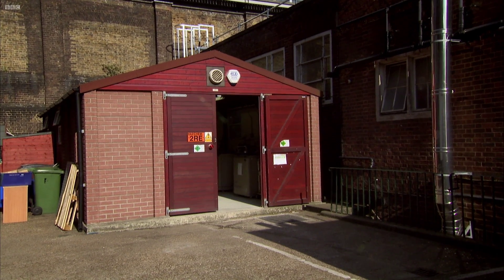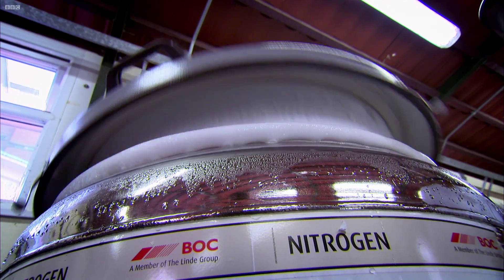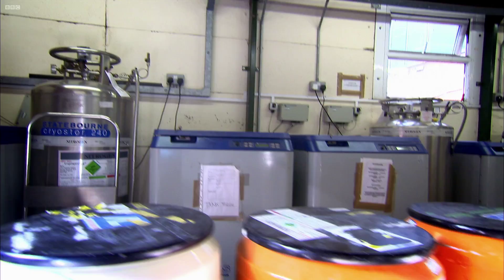The presenter is surprised to find it really is a shed. Despite its modest appearance, this one small building can store tens of thousands of samples.